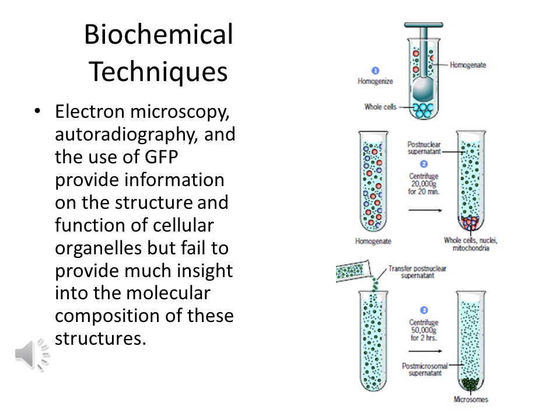By this density gradient technique, it was found for the first time that the primary site of protein synthesis is the rough endoplasmic reticulum. What makes the microsomes rough, and is involved in protein synthesis, is the ribosome, not the membrane. The membrane has no such role. This was found out for the first time by density gradient centrifugation.